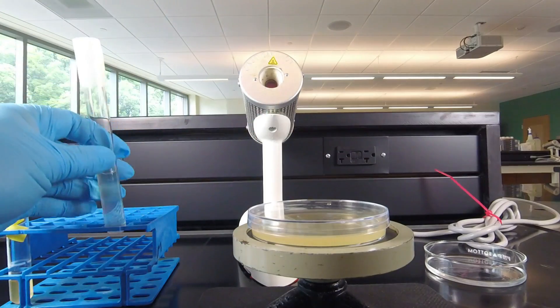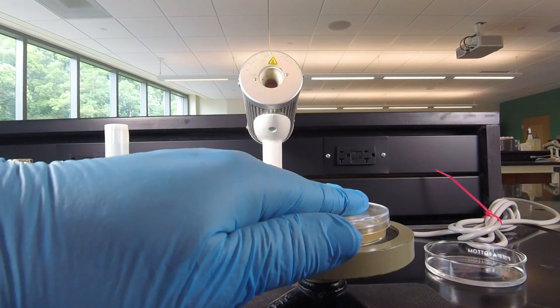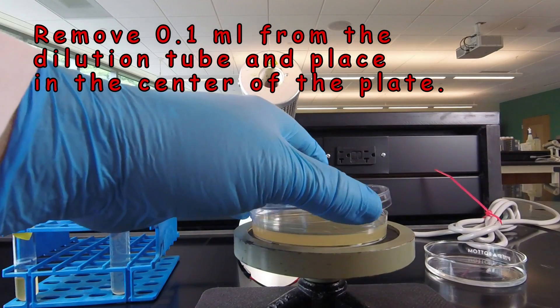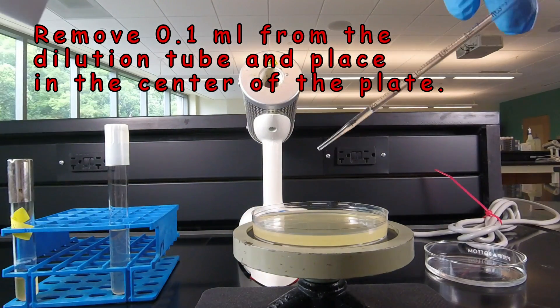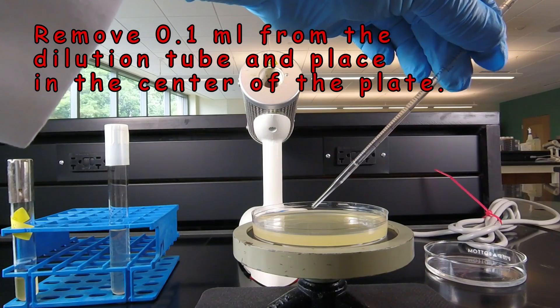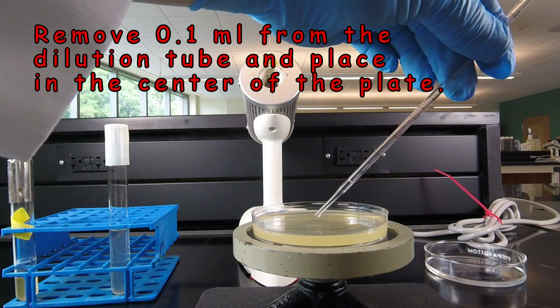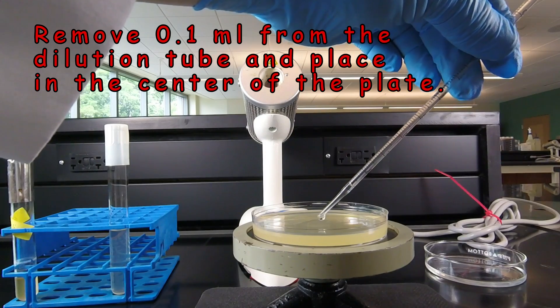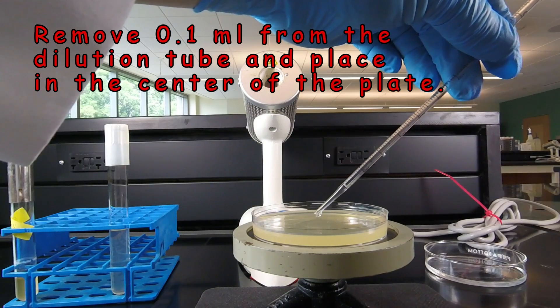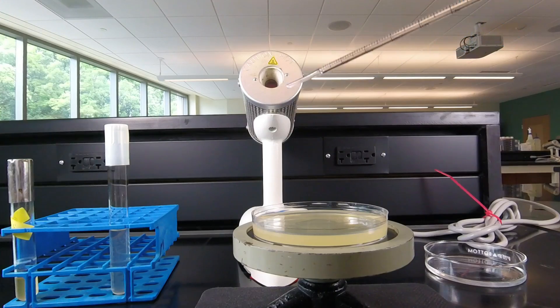Now we're ready to put the bacteria on the petri plate. To do that we do have to remove the lid. You want to have good control over the pipette. We're going to dispense that tenth of a milliliter in the center of the plate. So there is our one tenth of a milliliter. It's about three drops.